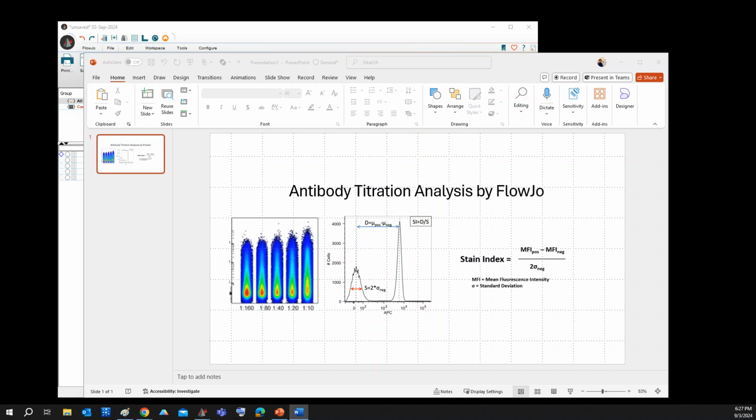You choose low brightness fluorophore to high brightness fluorophore. You make sure you definitely have very little spillover as much as possible, and consider all the co-expressed markers, choosing the right clone of antibody.